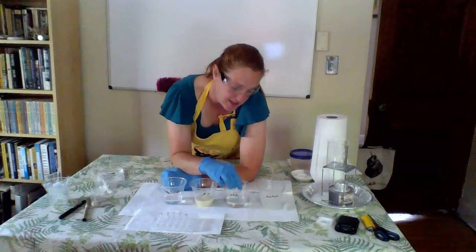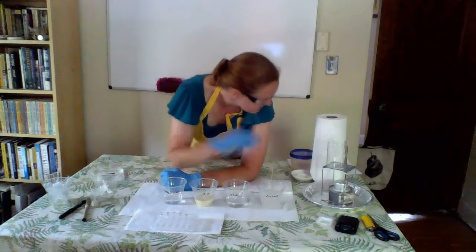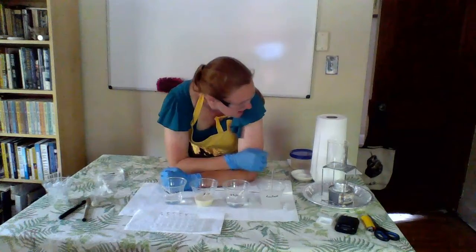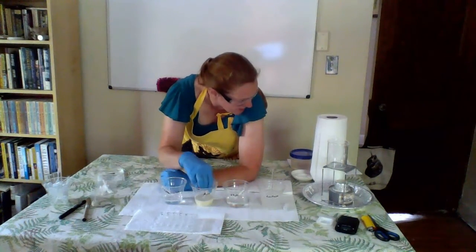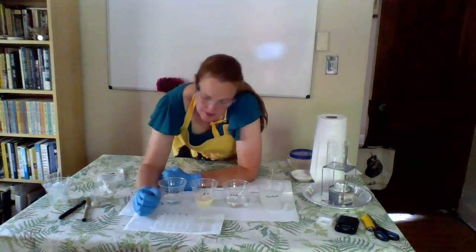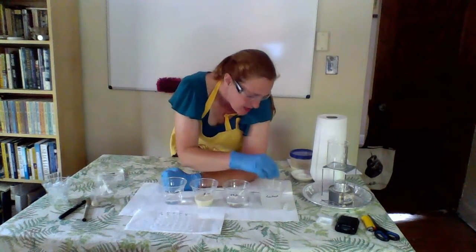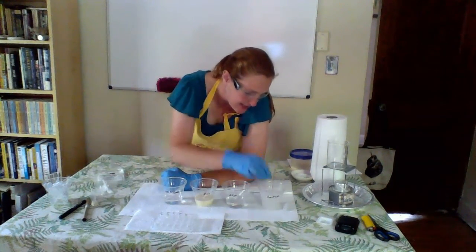I'll add to well B my 3 drops of distilled water. Into well C, I'm going to add my 3 drops of sucrose solution. 1, 2, 3. Then I'm going to add 3 drops of lactase.